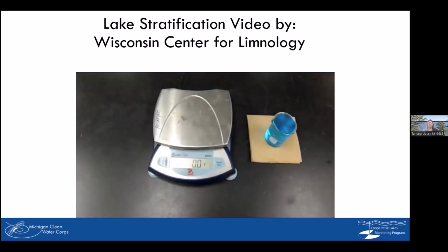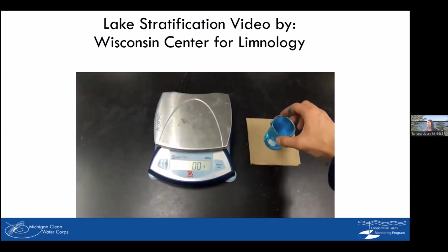Density is the amount of stuff in a given volume. In our case, that stuff is water, and that volume is this glass beaker. This beaker is filled to the brim with our cold water. Let's see how much it weighs.